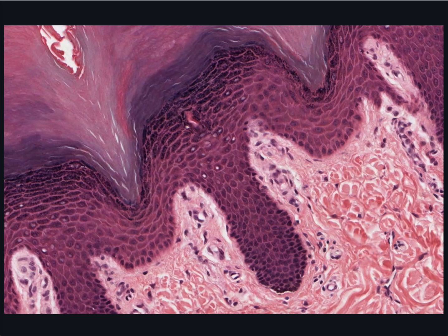Now this is an image of the epidermis at higher magnification. It's important to be able to identify the stratum basale or germinativum, the stratum spinosum, stratum granulosum, the stratum lucidum, and the stratum corneum. The two lowest layers are sometimes jointly referred to as the Malpighian layer.